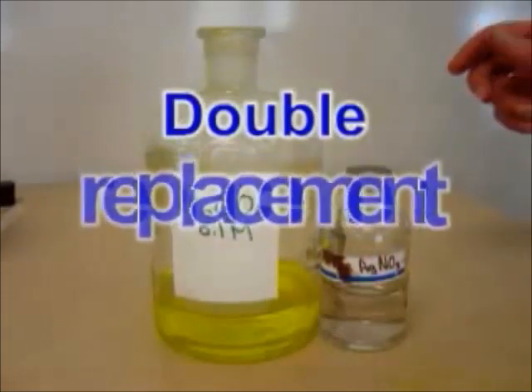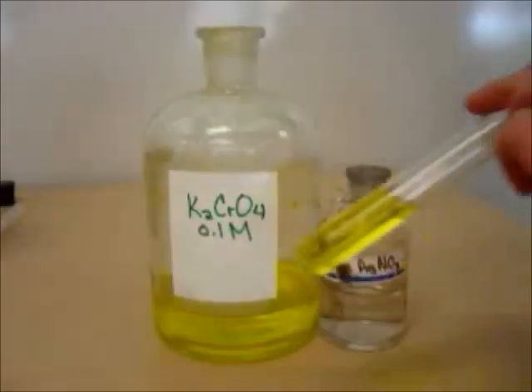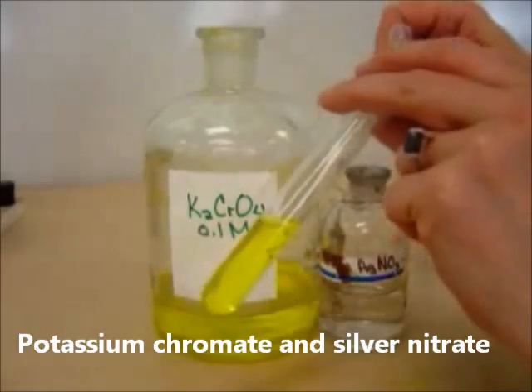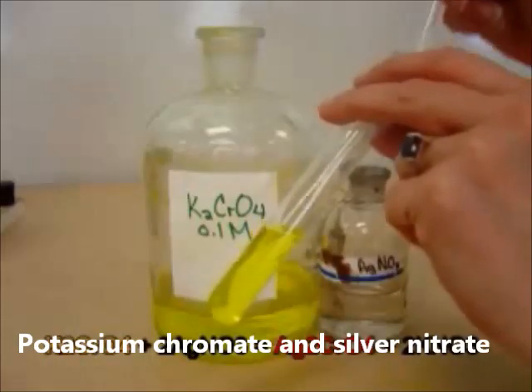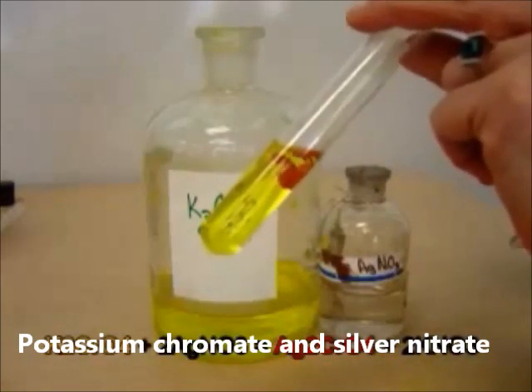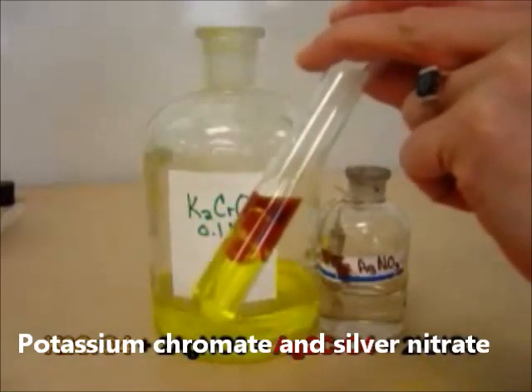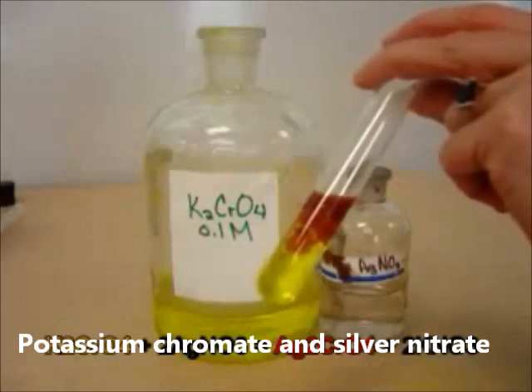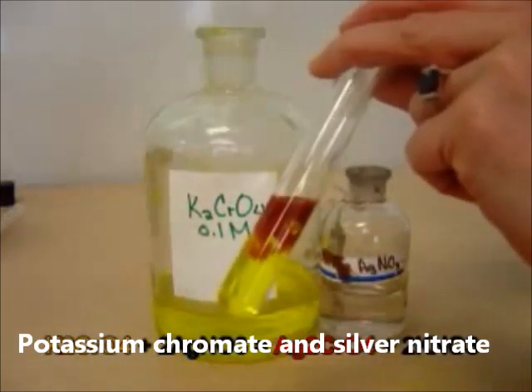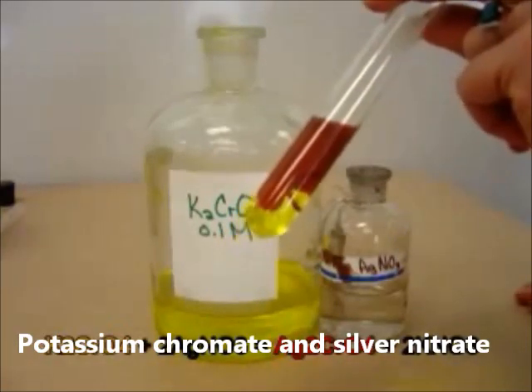We're going to do a double replacement reaction with potassium chromate and silver nitrate. Here's my potassium chromate, and when I add silver nitrate to it, I am forming a nice red precipitate. The precipitate is silver chromate — it's a double replacement reaction.